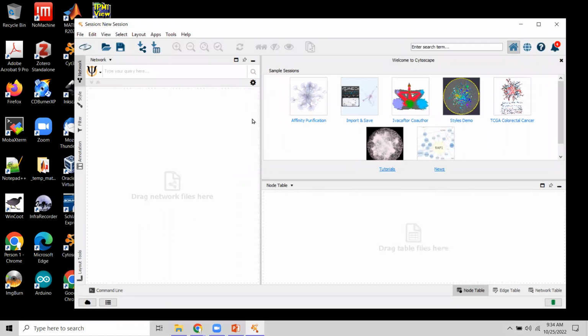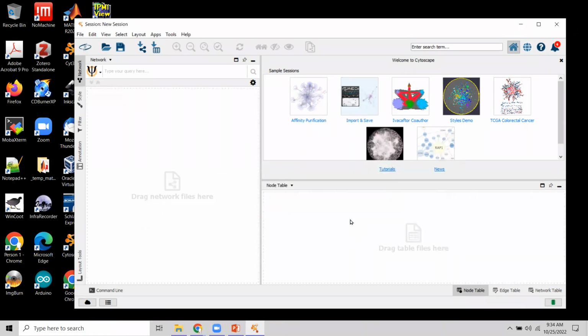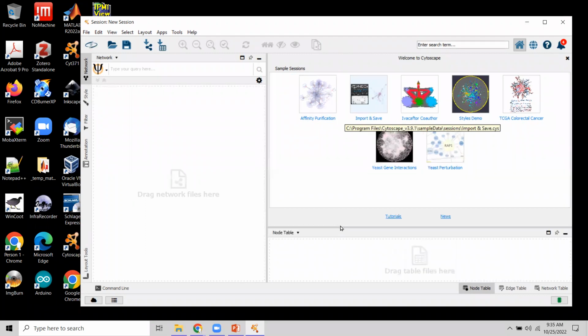And this is essentially a collection of, okay, whatever it is. Hopefully it's not gonna hurt me. At least not today. Okay, so this is essentially a collection of 3 panels.